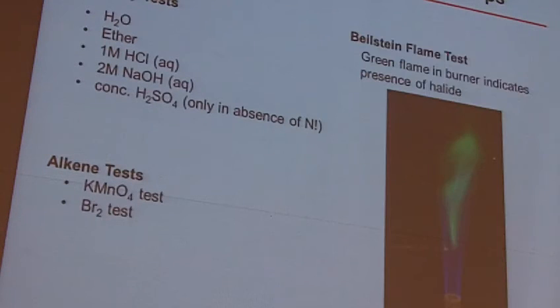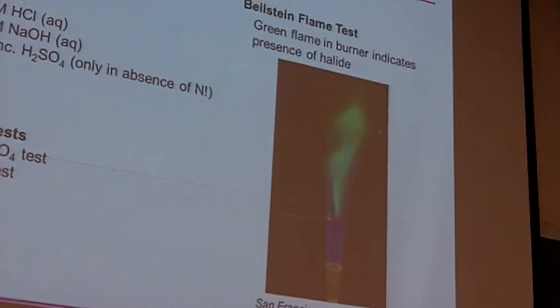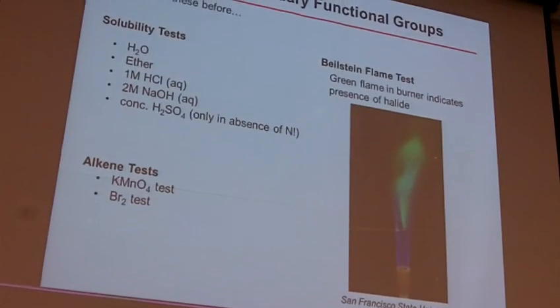And then also to test for halides, the good old Beilstein flame test. So everybody should do this one as well. Go ahead and put a little compound in there and put it on the burner. And if you see that bright green flame, you know you've got a halide. All right, and so with that now, you should have a pretty good idea of the secondary tests, and you've got your primary functional group, and that's all wrapped up. You should have a pretty good idea of what functional groups you have present.